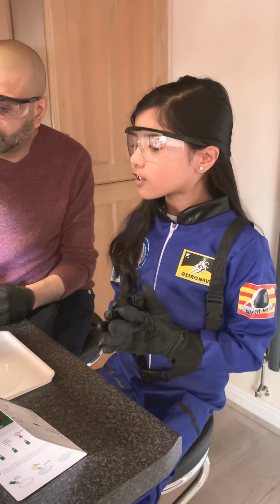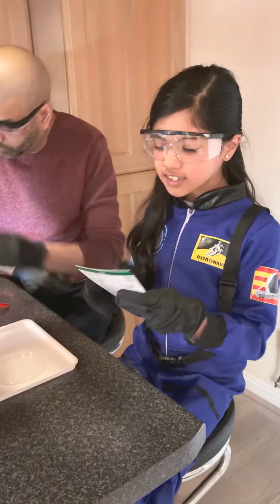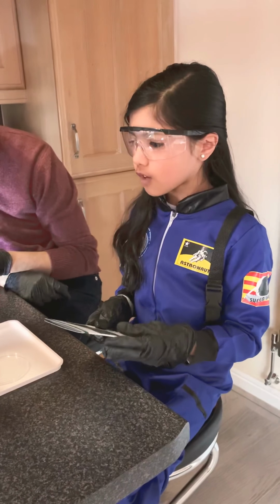So today we are going to be making tin dendrite. Tin dendrite is a metal tree that grows before your very eyes.